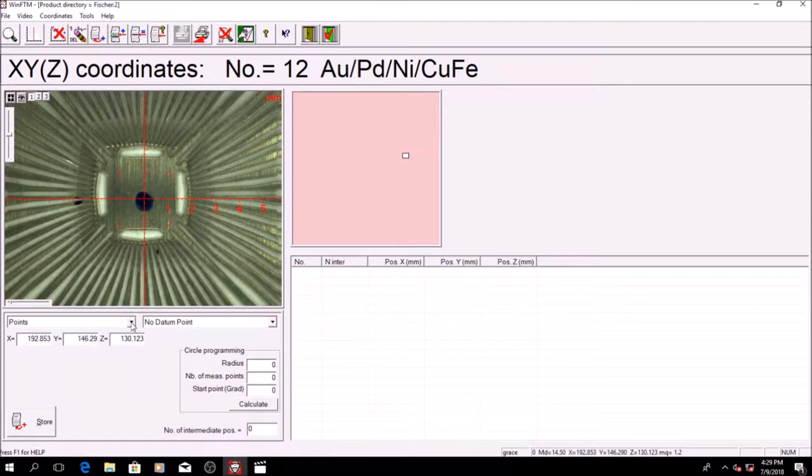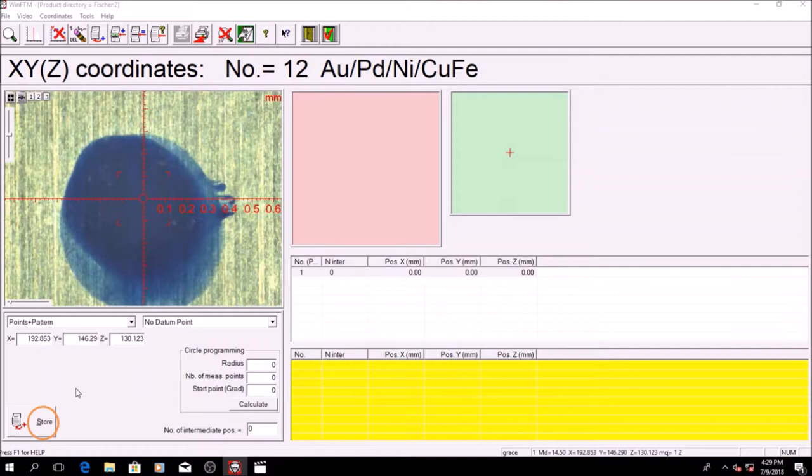To repeat a pattern of points, click on XY programming followed by points and pattern. Change the zoom factor from 1 to 3 and store the points you would like to measure. In this case, I would like to measure 3 points on each lead frame pad.